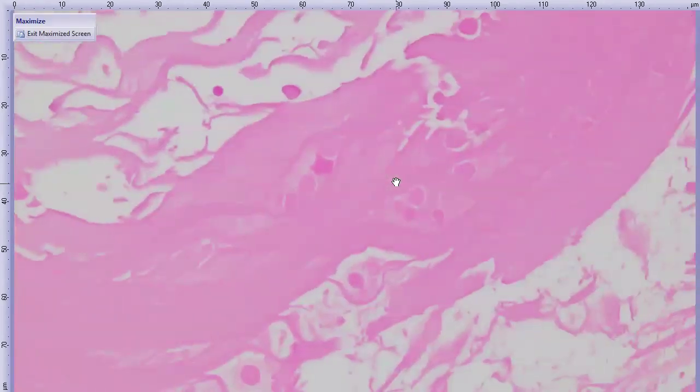But the presence of these macrophages intermingling with these degenerate lens fibers is indicative of true inflammation. Got some nice Morgagnian globules here. So we do have evidence of lens capsular rupture and a pretty severe cataract.